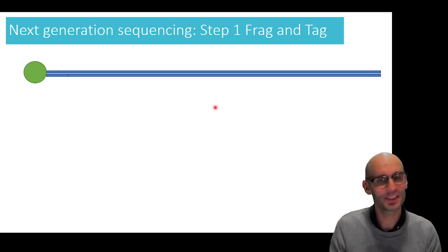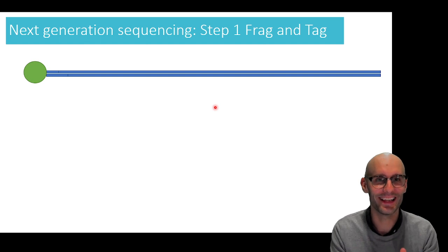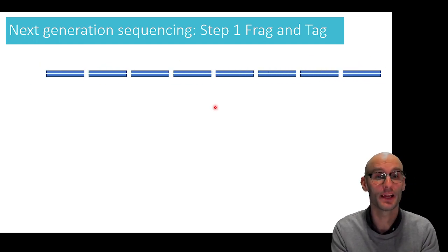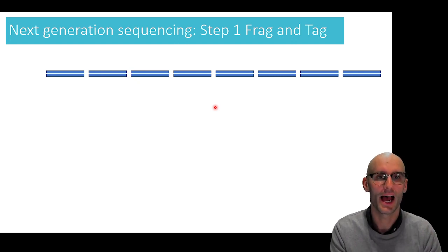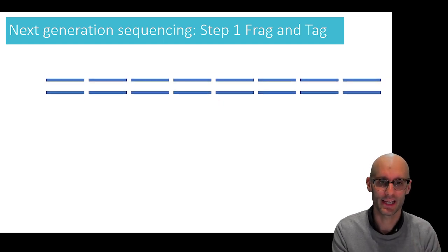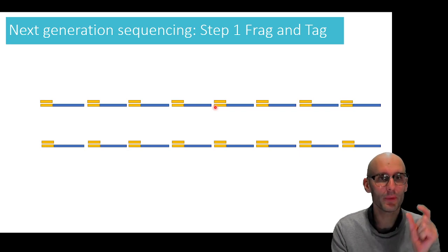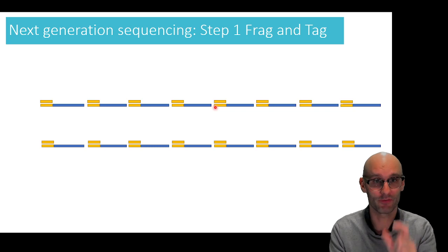Okay, so first up, let's just do the steps. First one is frag and tag, right? So we're going to fragment the DNA and tag it, attach a little barcode onto it. So we take the DNA and we fragment it up into lots of little bits. We can do that enzymatically, which is what you just kind of saw, but you can also use high energy beams of some sort to fragment up the DNA. Now we then split it into single strands for sequencing, and then we add a little double strand at the bottom to tag each piece of each fragment.